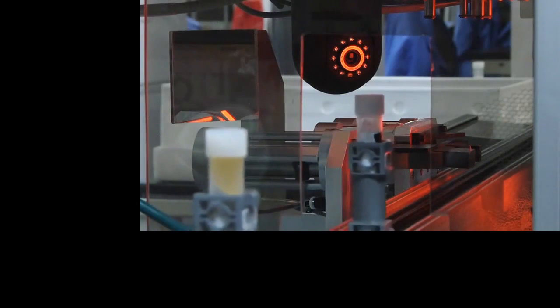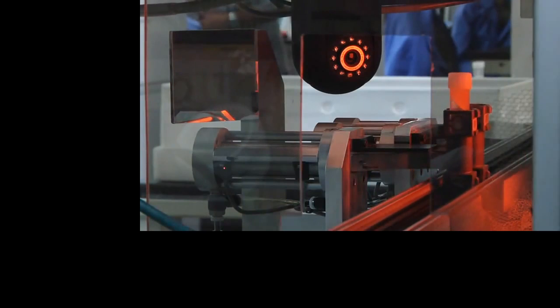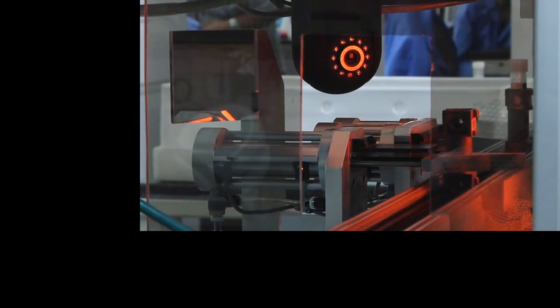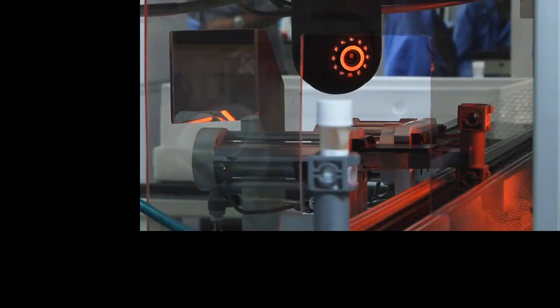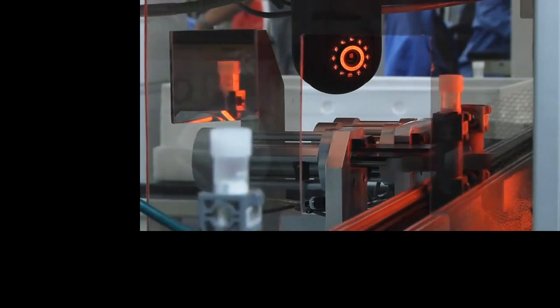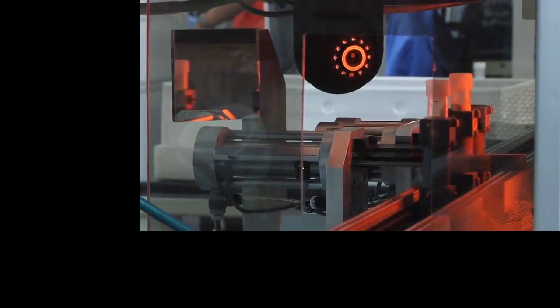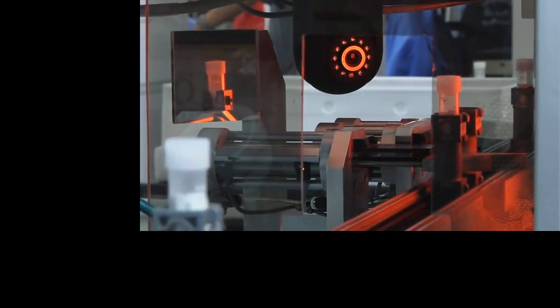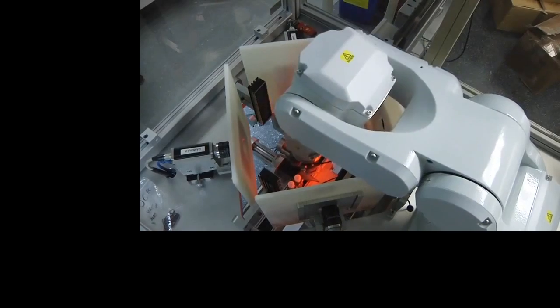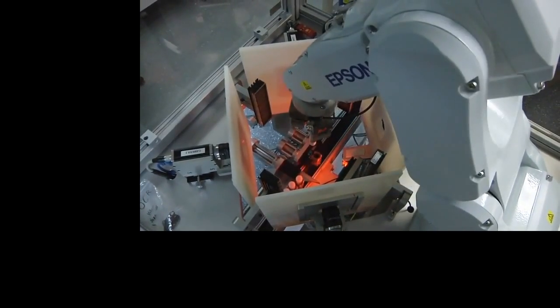This view again shows the transport carriers, with tubes arriving at the stopping point, where the robot will lift them to the vision system. On the left you can see the 45-degree mirror that the smart camera uses to measure the tube's dimensions to guide the robot in correctly picking up the tube by its cap. This view from the top shows the robot and vision system.